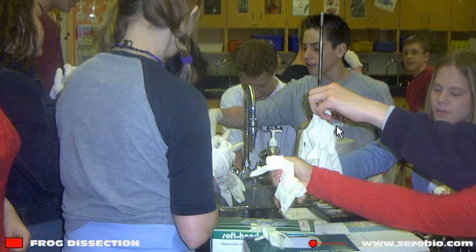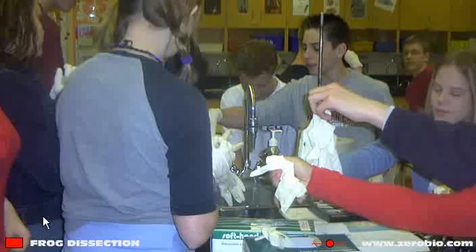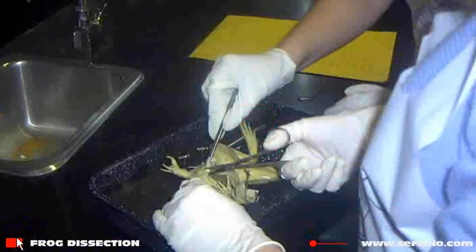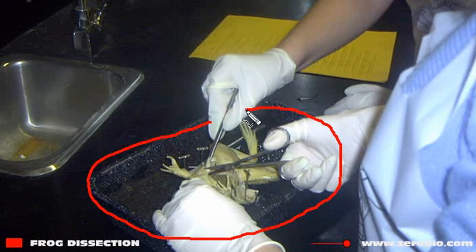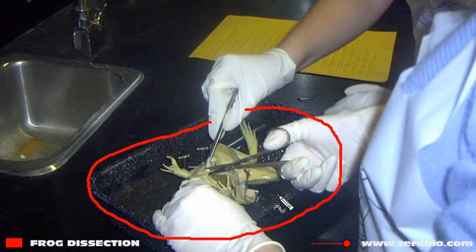Looks like a happy bunch of students ready to get into the dissection. Once things are underway, you are going to put your frog into a dissection tray, and that's what you'll use to do all your manipulations. You can also pin the frog down — there is a dissection pin there holding down the flap of skin.